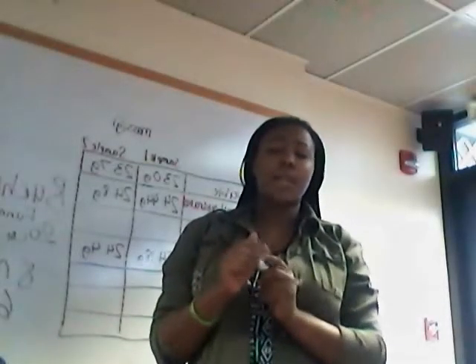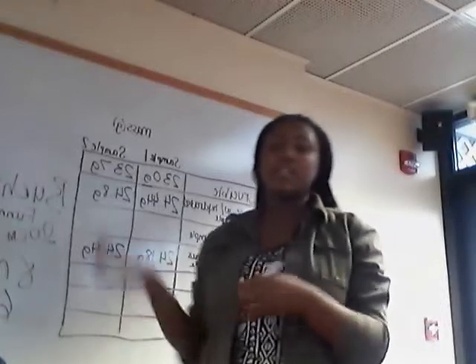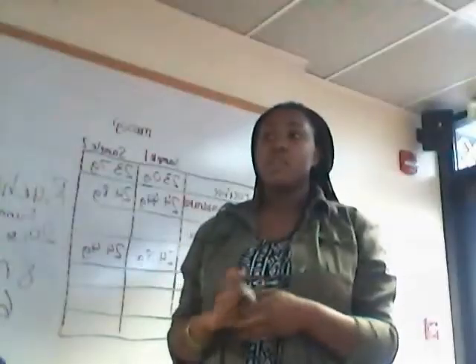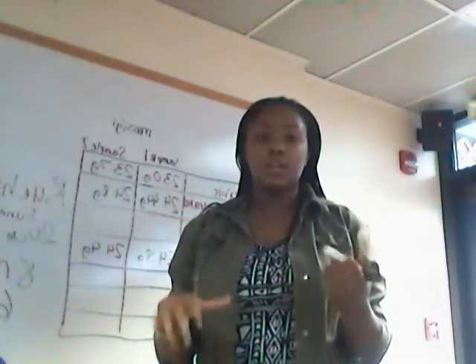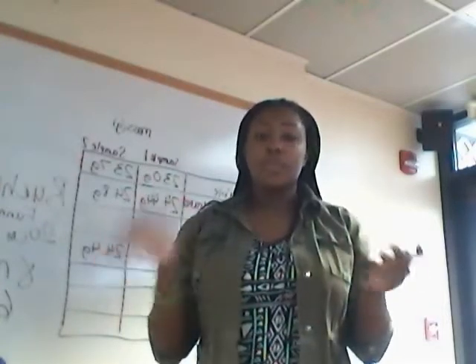Well, sometimes to pass time, you just do the gravity filtration. If you know how to set that up, let the water run for like 5 minutes and let it filter properly. So the HCl and aluminum that has been dissolved in the substance has been filtered completely.